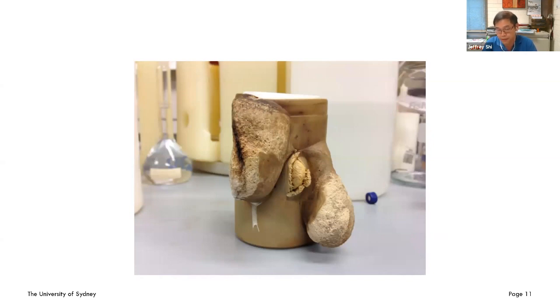But that particular student ignored this limit. You put too much water there. Imagine for a 100 milliliter vessel, you put 98 milliliters of water there. When heated up, it will expand with overpressure. So the consequence is an incident. That type of case study we use for every student to learn from.